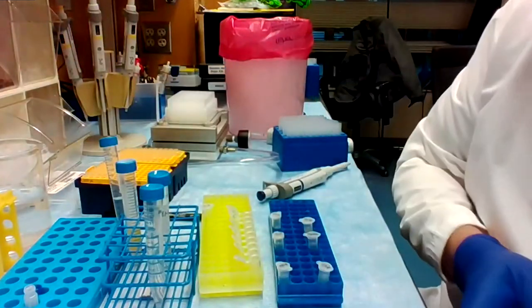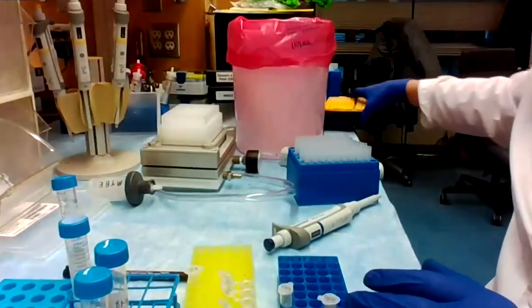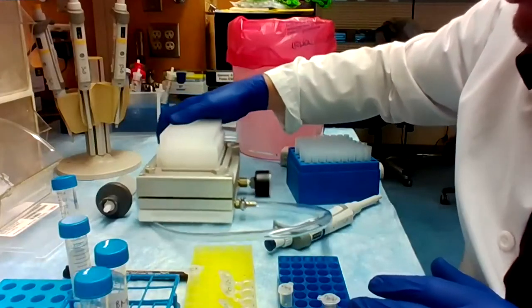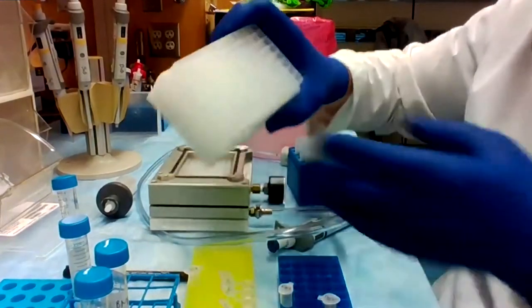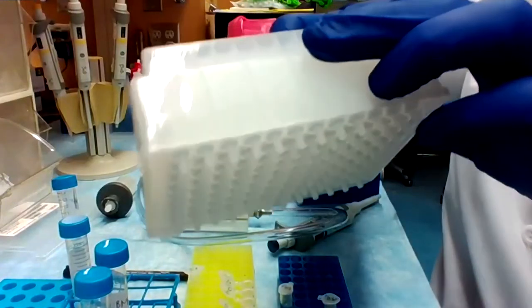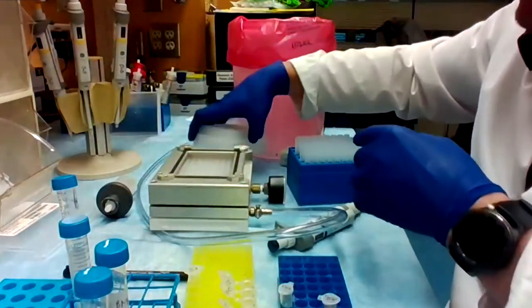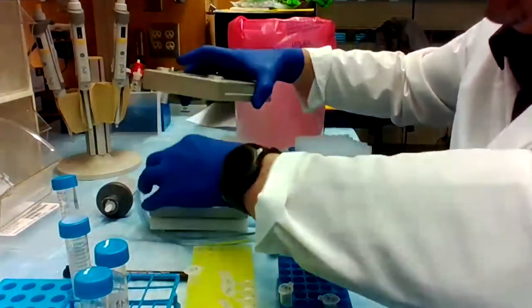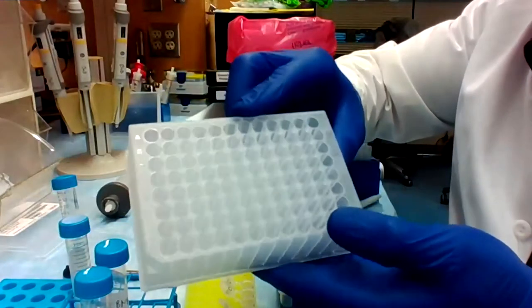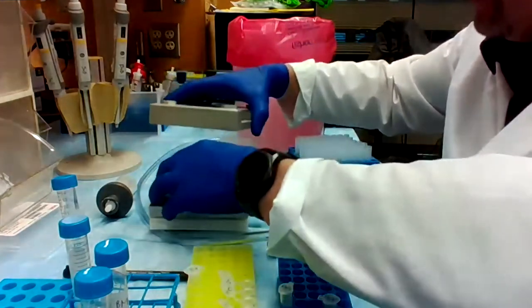Lastly, what I have is a solid phase extraction apparatus. We can also do dilute and shoot or do protein cleanup with this. You can see the solid phase extraction on the bottom — this will do 96 samples at once, and I can collect it by vacuum into a 96 well plate for further processing or direct injection into the mass spectrometer.